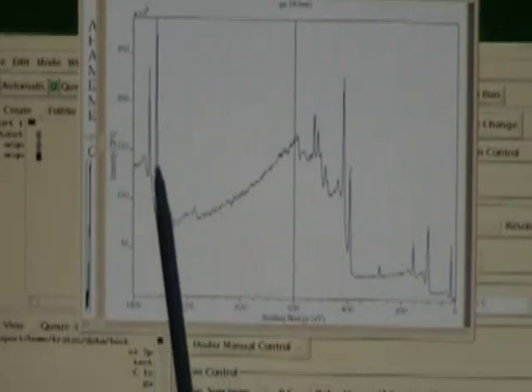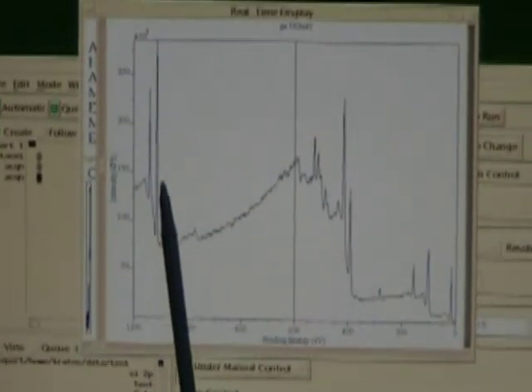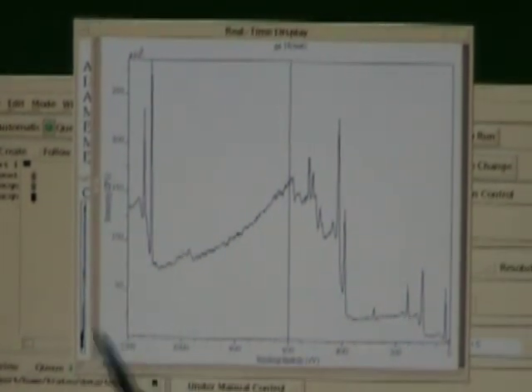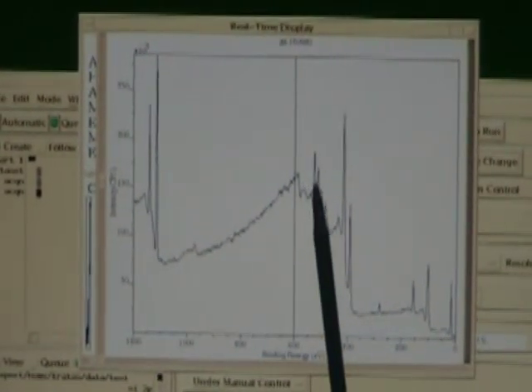There's a nitrogen peak blended into this gallium. What we're going to do now is go in at higher resolution. We'll take a look at these two gallium peaks just to make sure that they are in a single bonding state.